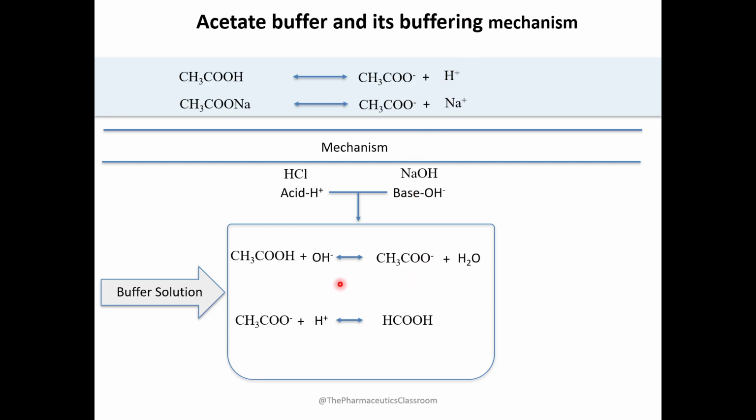In this buffer solution, we can see how it resists pH change. Whenever I add a small amount of acid, this acid will react with the acetate ion.